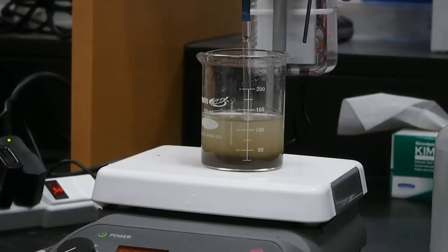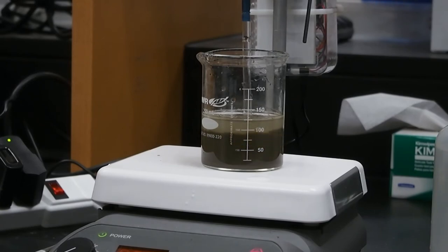So here it is in action, and as you can see it works very well. I have actually increased the stirring speeds here. I don't usually stir my samples this fast, but for the purpose of this video I just wanted to demonstrate its ability.